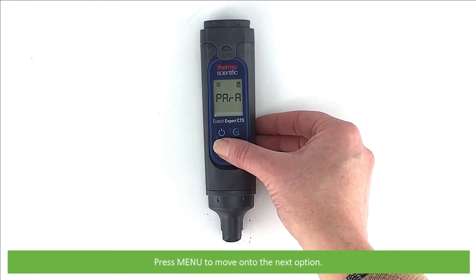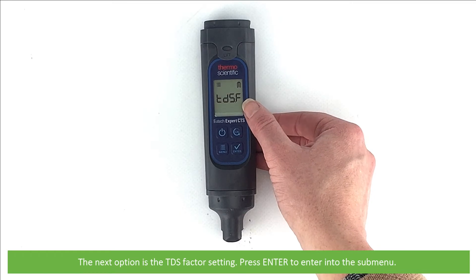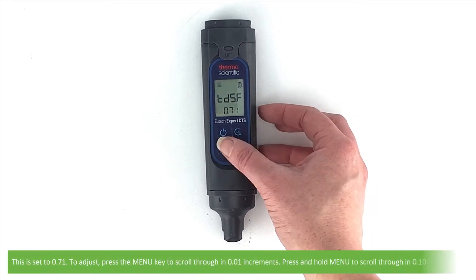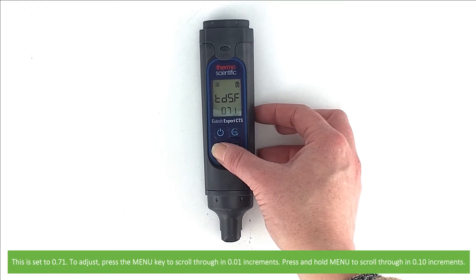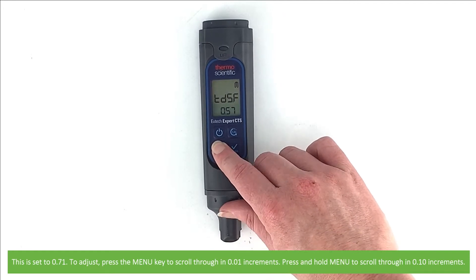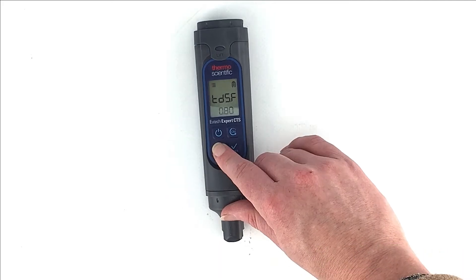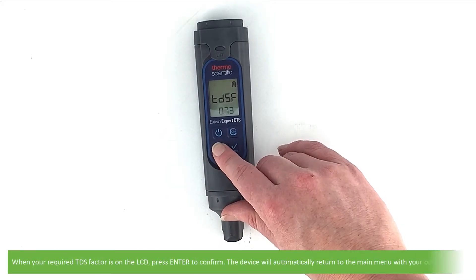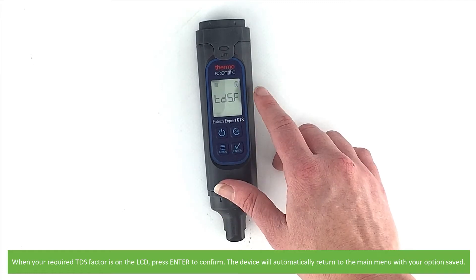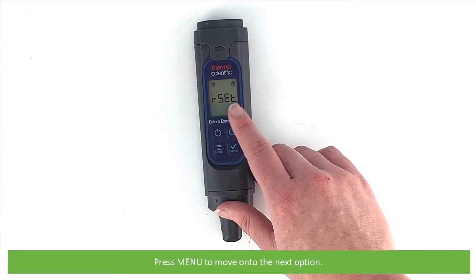Press Menu to move on to the next option: TDS factor setting. Press Enter to enter into this submenu. This is set to 0.71. To adjust, press the Menu key to scroll through in 0.01 increments, or press and hold the Menu key to scroll through in 0.1 increments. When your required TDS factor is on the LCD press Enter to confirm. The device will automatically return to the main menu with your option saved.